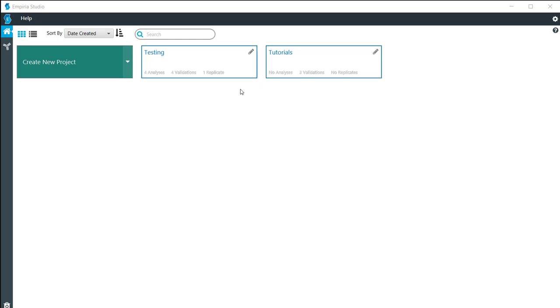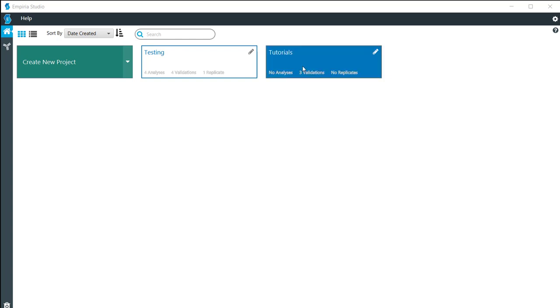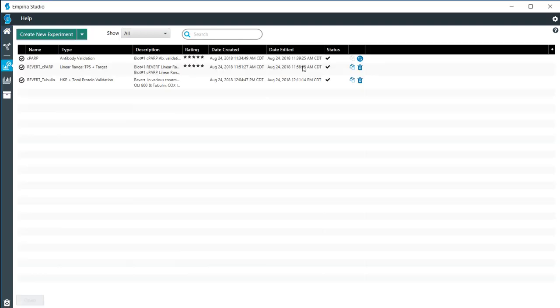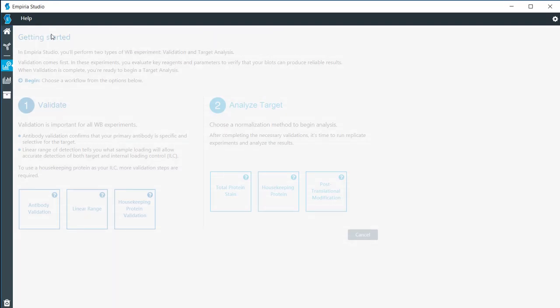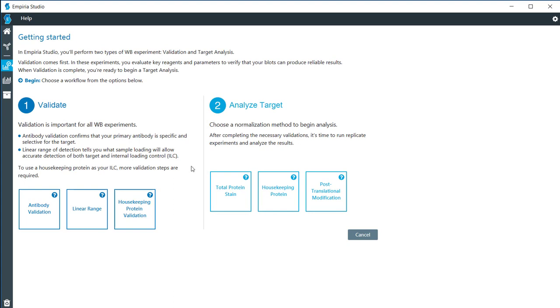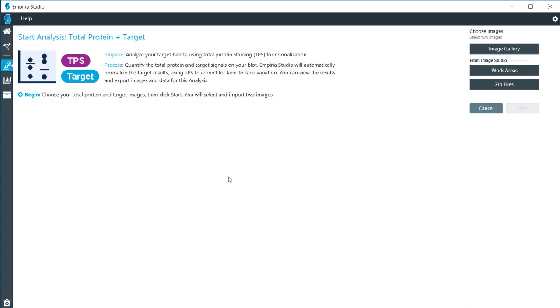In this video, I'll be taking you through the steps of analyzing a target that has used a total protein stain for normalization. I'm going to open up the tutorials project that I have here and click on Create New Experiment. Under Analyze Target, I'm going to click on Total Protein Stain for the normalization.